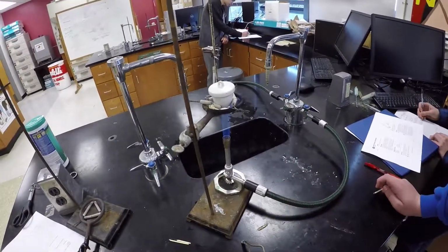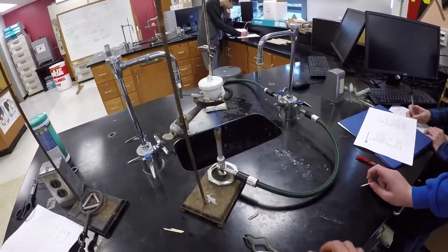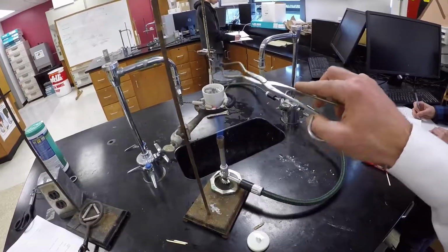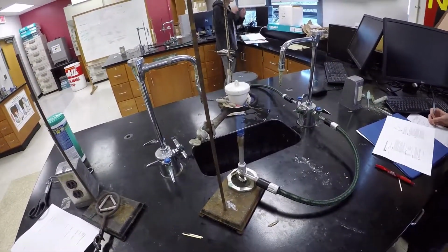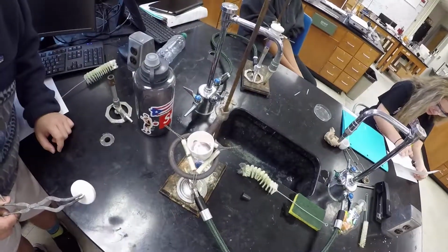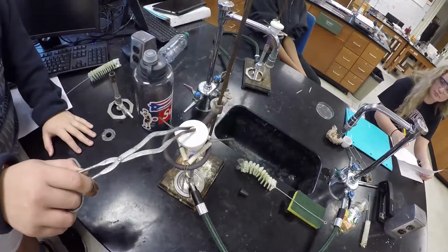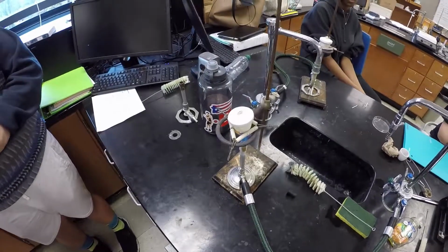How fast that heats up. What about the cap? Yeah, you're going to want to put that in there. So what we'll do right now, we'll take this off, and we'll just drop that in there. It only took like 30 seconds. You can already see how red hot that's getting. Put your goggles on there. Yeah, put it on top. Now it's getting light. That's good. The oxygen is what's causing that brightness.